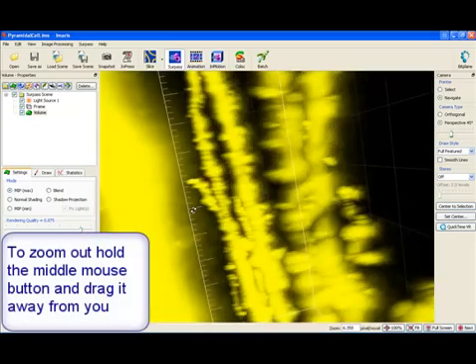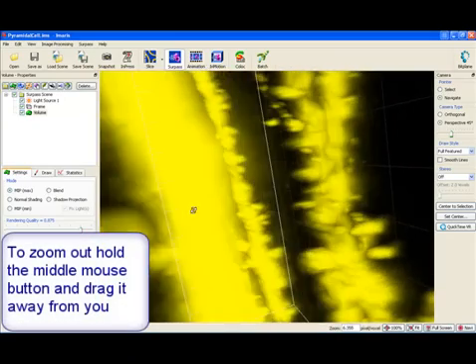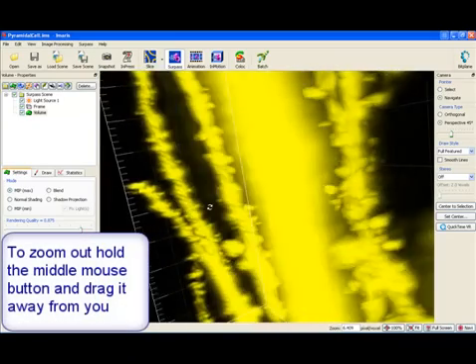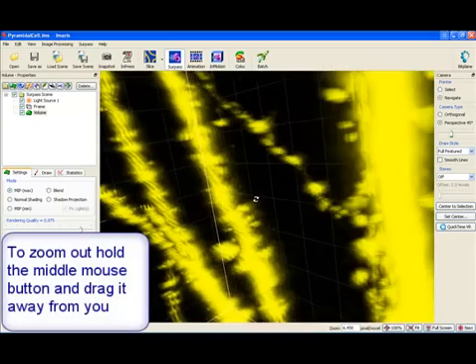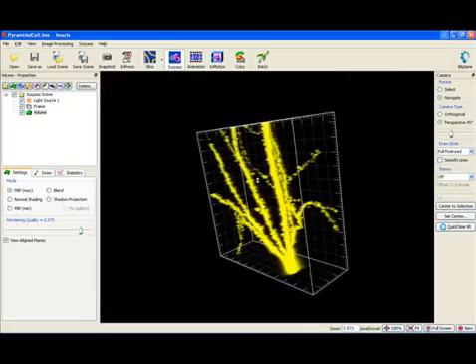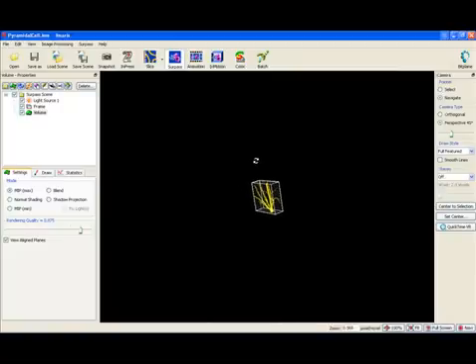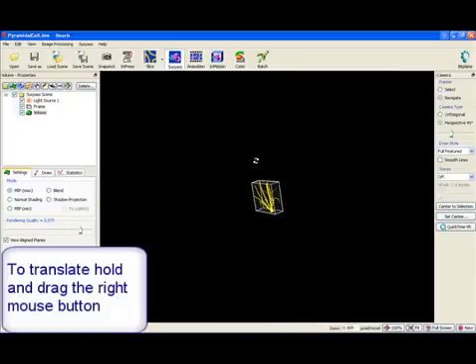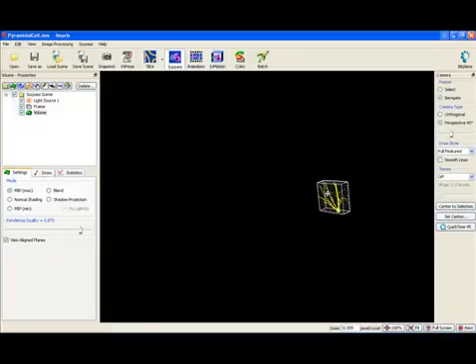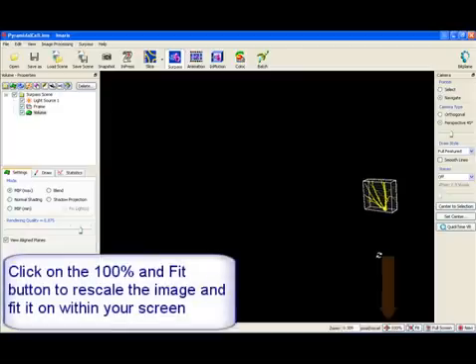To zoom out from the image hold the middle mouse button and drag it away from you. To translate the image hold the right mouse button and drag the image to the chosen location, then simply release the button.